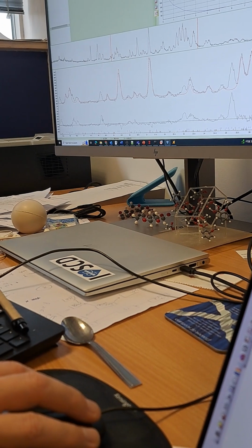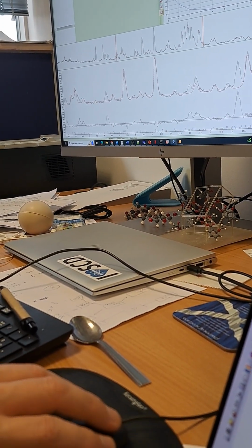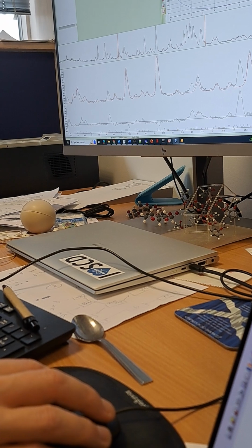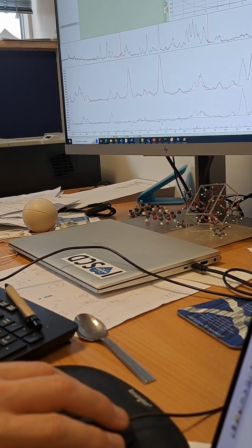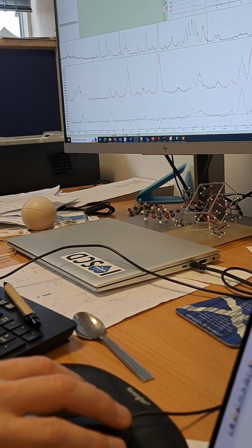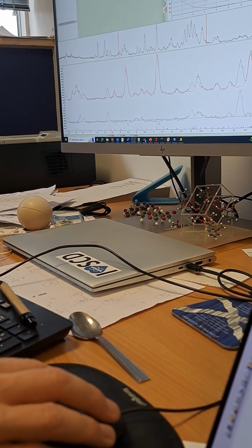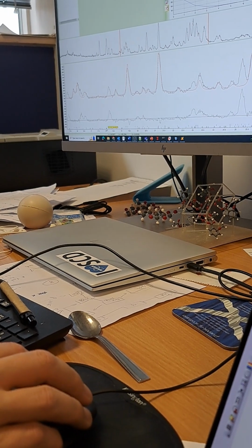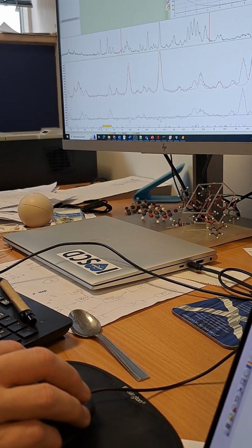for example, this one is potentially 151. Okay, so where is that 151? Is that in here somewhere? 15 minus 1. Okay, what is this big peak? 121. So that's there, right?